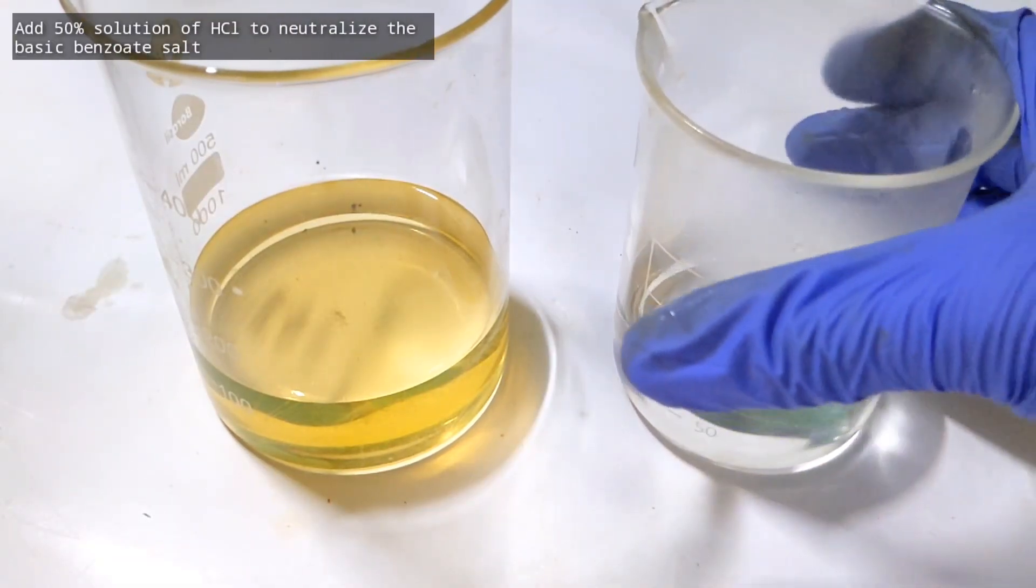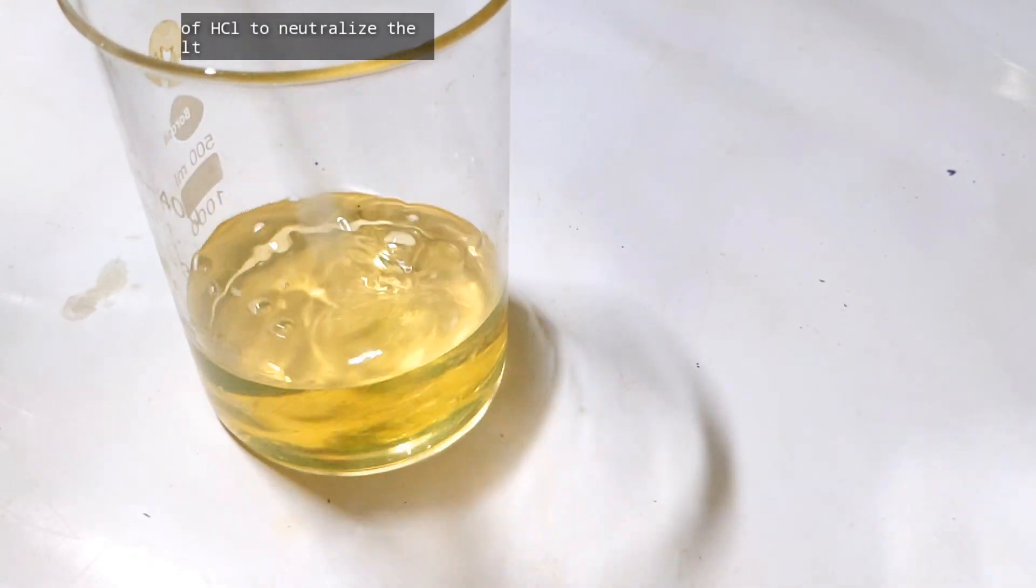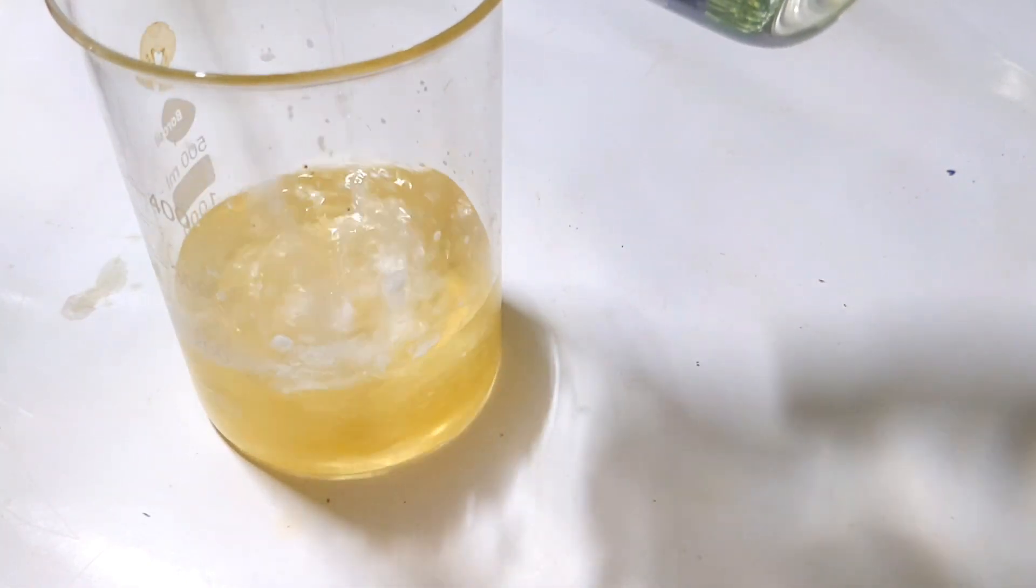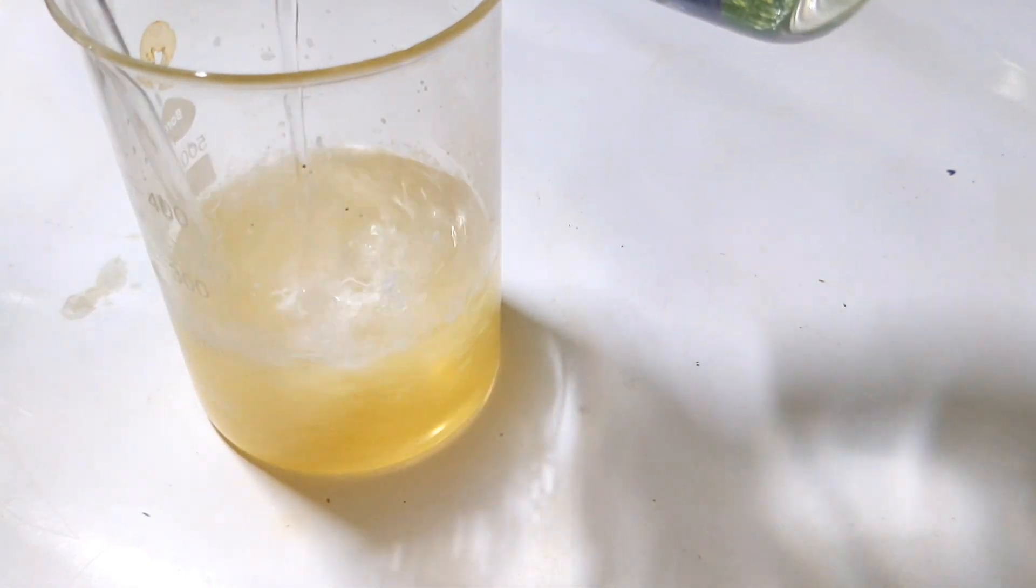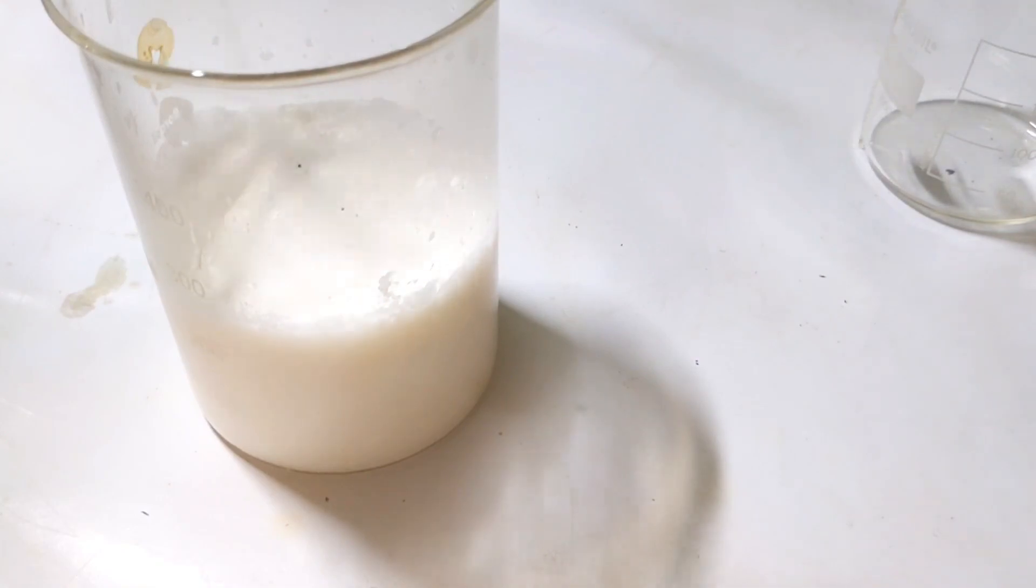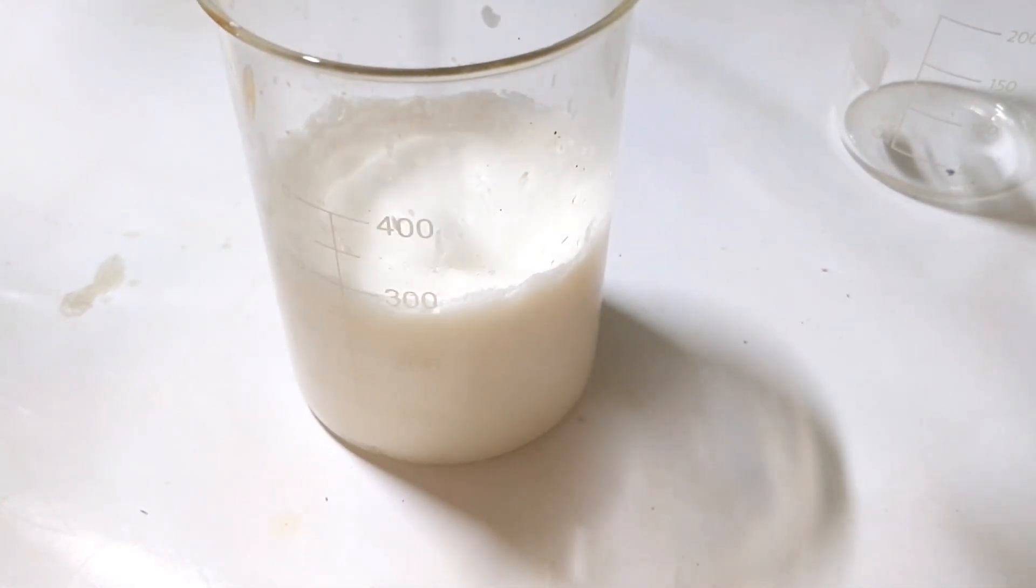Now moving on to the separation of benzoic acid, into the aqueous solution which we had separated from the ethereal layer, we add hydrochloric acid very slowly as the addition of hydrochloric acid to base is an extremely exothermic neutralization reaction. Once the pH becomes neutral, you can see benzoic acid will precipitate out and a white precipitate of crude benzoic acid is obtained.